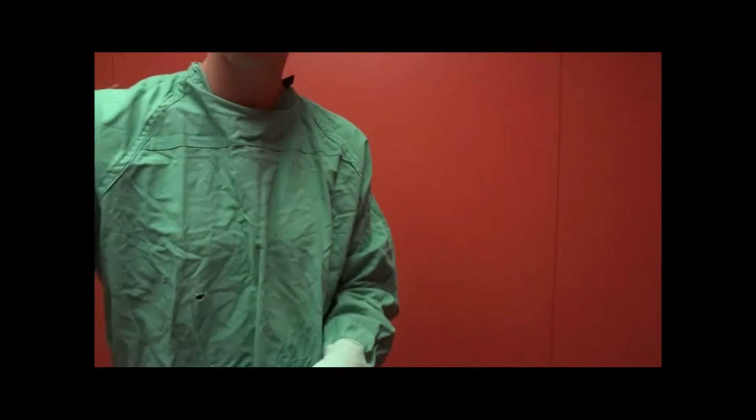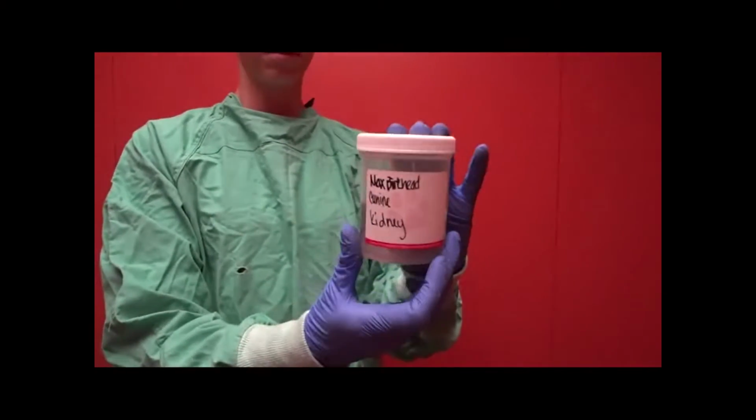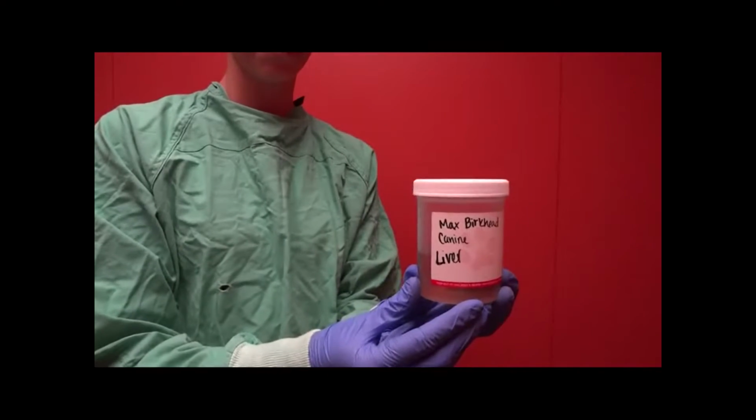Alright, so we have our samples from the necropsy. We've taken a kidney, labeled, and a piece of the liver, labeled. I'll now be discussing how we take and approach an animal that is suspected for rabies.